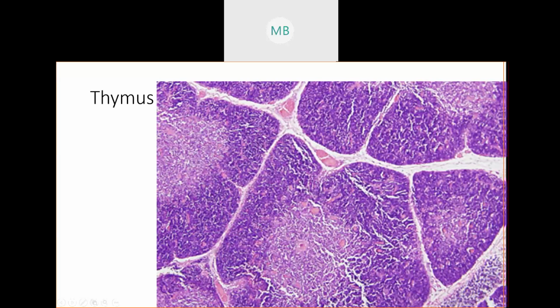Another thing to note about this is you can see that there is a lighter, stringier kind of middle and a denser, more meaty looking outer part of all of these lobules. That is going to be a theme of anatomy and physiology here. You're always going to have, or not always, but a number of different organs have lighter, stringier centers, and then more meaty, dense outer parts. Your kidneys are a good example of this. Your adrenal gland also has this.